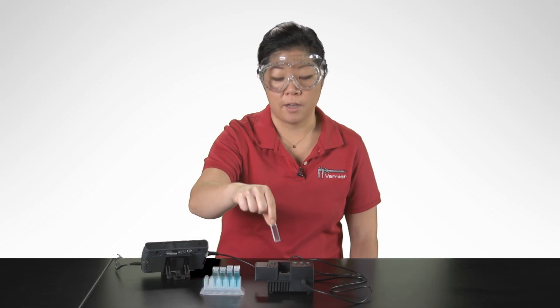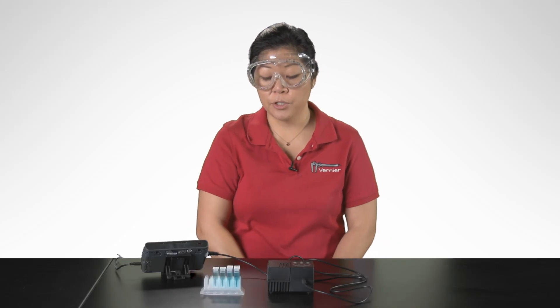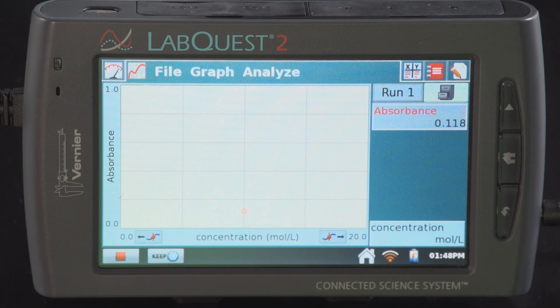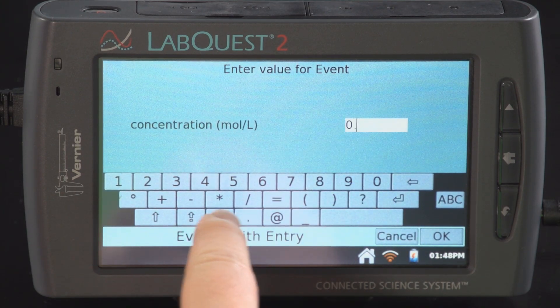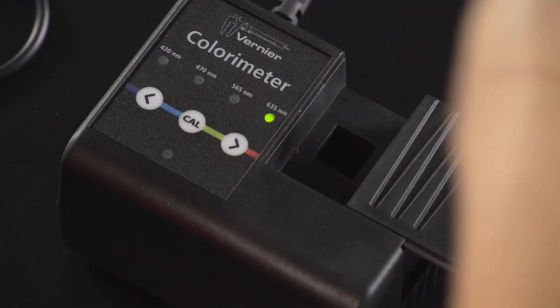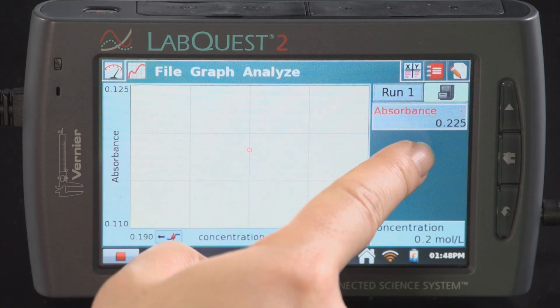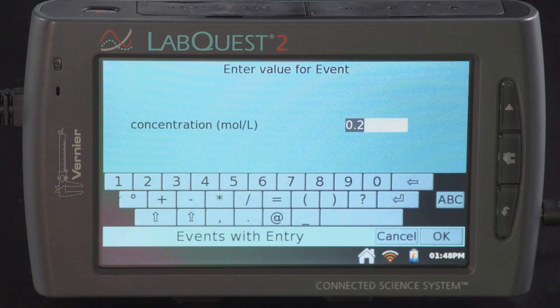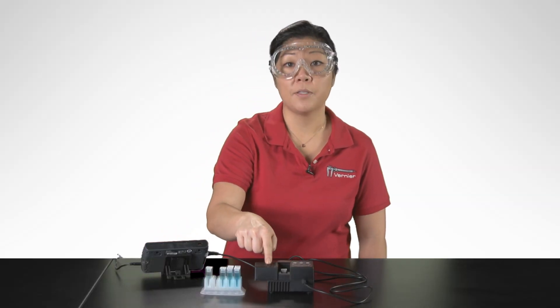Insert your first sample into the cuvette slot. For these samples, I have arbitrarily determined them as 0.2, 0.4, 0.6, 0.8, and 1 molar. Once the reading has stabilized, tap on the key button and enter the concentration. Remove the sample and place the next sample into the cuvette slot. Repeat these steps for the rest of your samples.